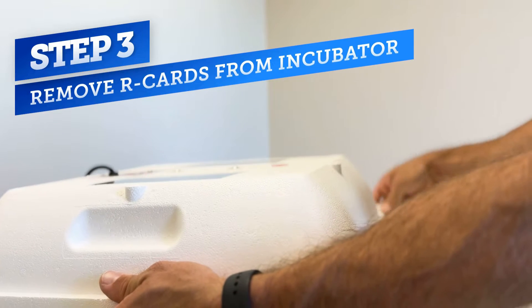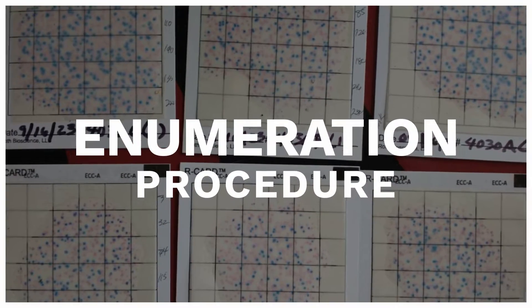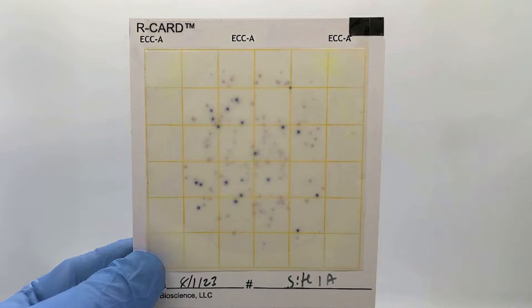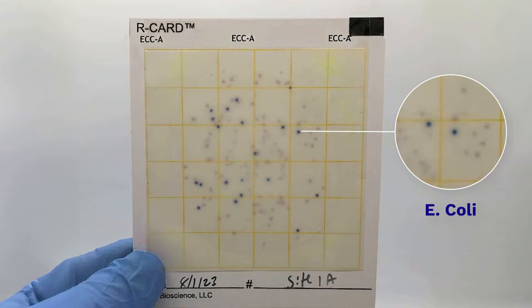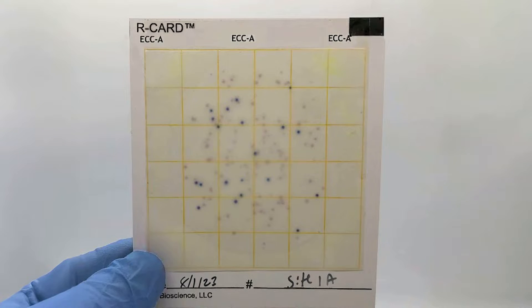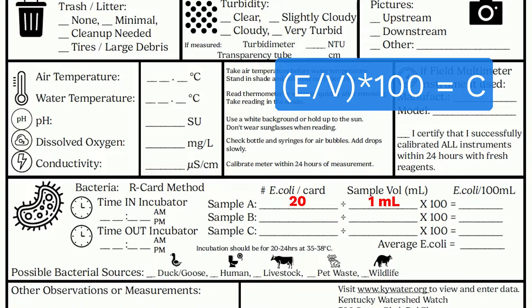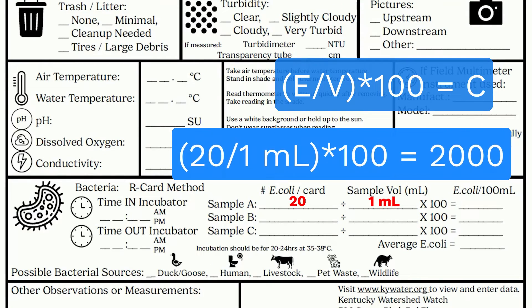Once 20 to 24 hours has elapsed, you can pull the cards for counting. Dark blue dots will appear showing E. coli colonies, and dark pink or red colonies will appear showing coliform colonies. To enumerate, simply count the number of dots for each type. For our card, you'll notice that we have 20 distinct colonies. After counting the colonies, we can record our data in our datasheet. To extrapolate the number of colonies present in a 100 milliliter sample, you divide the count by the sample volume, then multiply by 100, giving us an E. coli concentration of 2000 colony forming units.